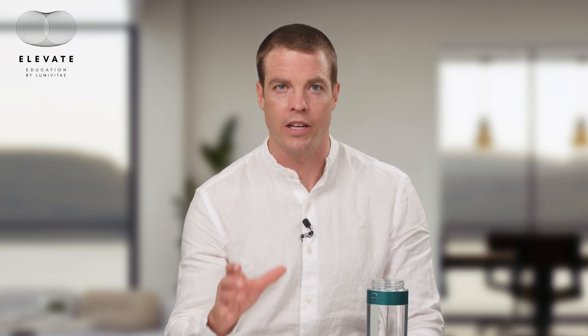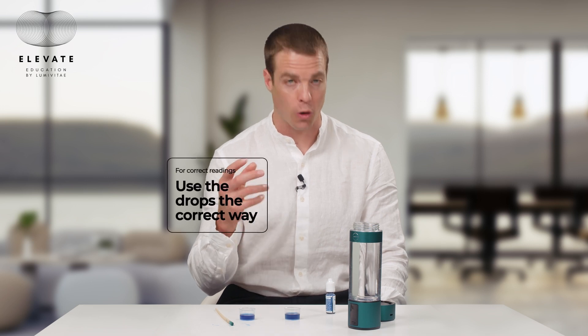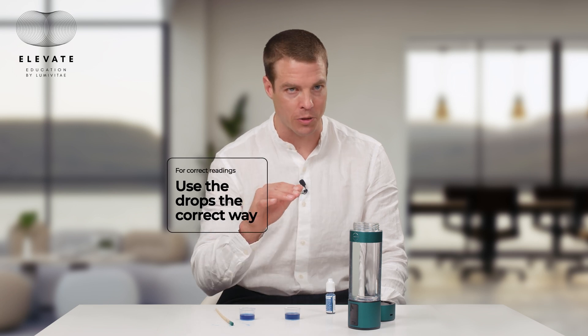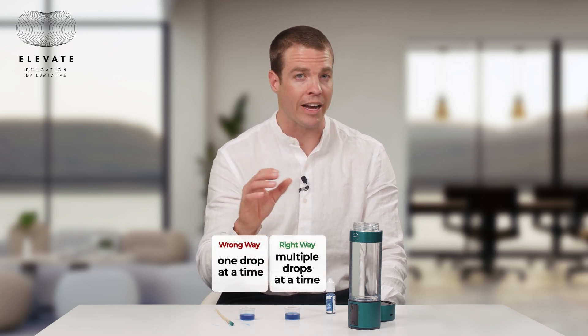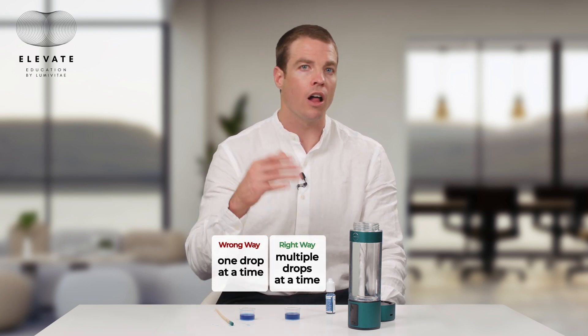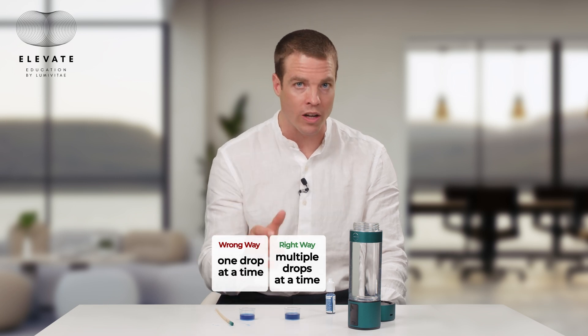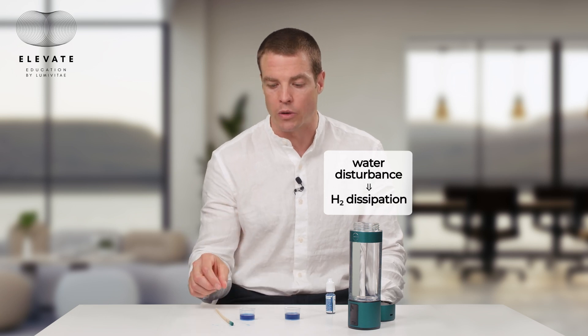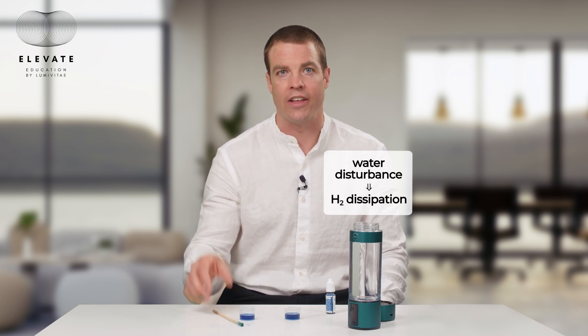So to recap: test the correct way by getting exactly six milliliters of water — not less, not more. One thing I like to do if I expect a concentration around one milligram per liter is to add eight or even nine drops all at once, so there's less disturbance to the water. Every time you add a drop it disturbs the hydrogen and causes more to dissipate. You'll also notice that when I did the wrong way I was stirring vigorously, which causes the hydrogen gas to escape at an exponentially faster rate.